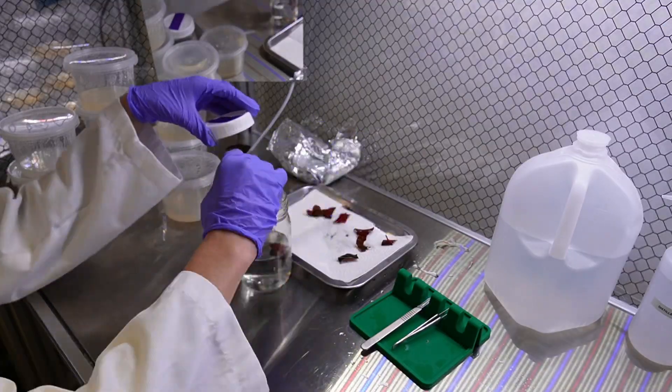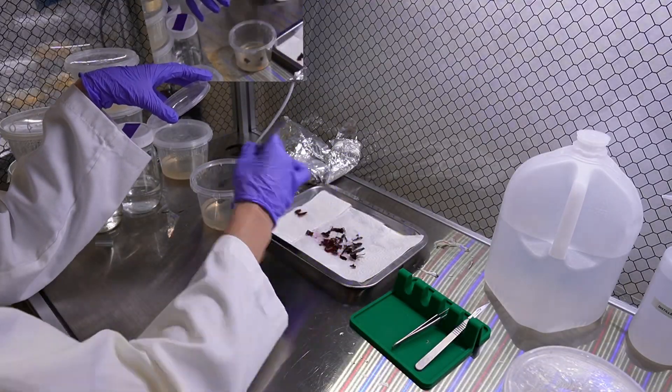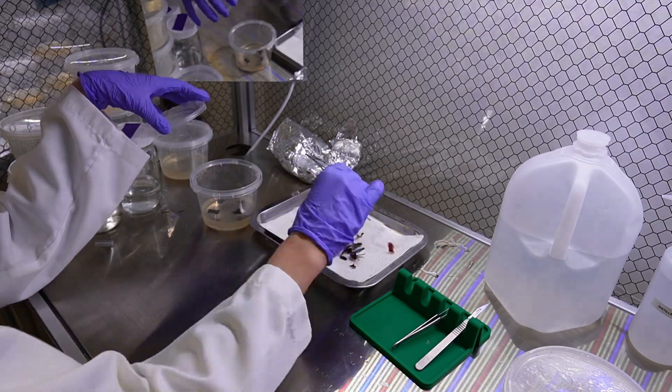We also tissue cultured begonias — my favorite plant in the world — from both leaf sections and also from nodal sections, which I hadn't tried before or even thought to try.